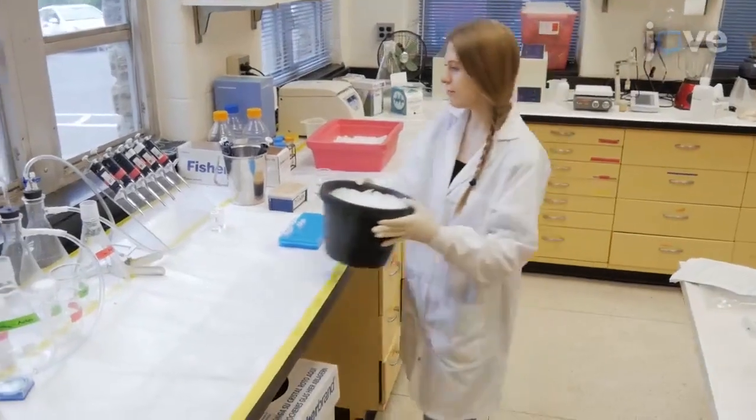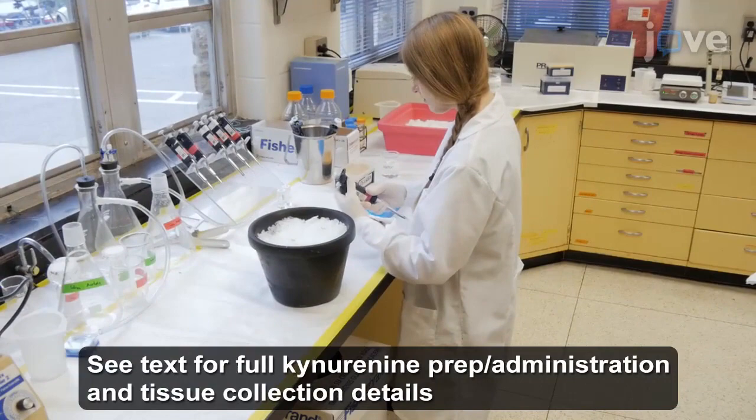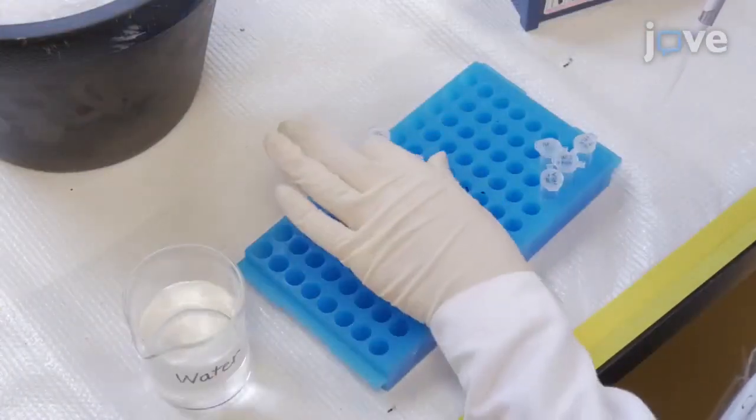At the appropriate experimental endpoint after intraperitoneal kynurenine administration, thaw frozen harvested plasma on wet ice, and dilute the thawed samples with ultra-pure water.